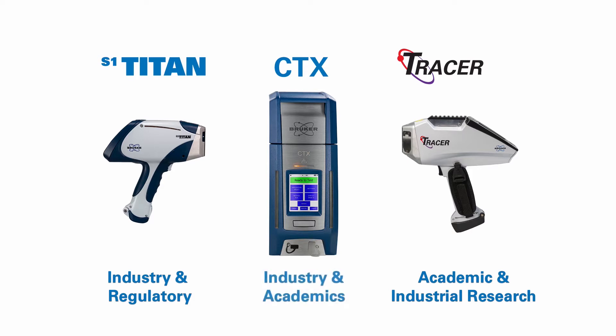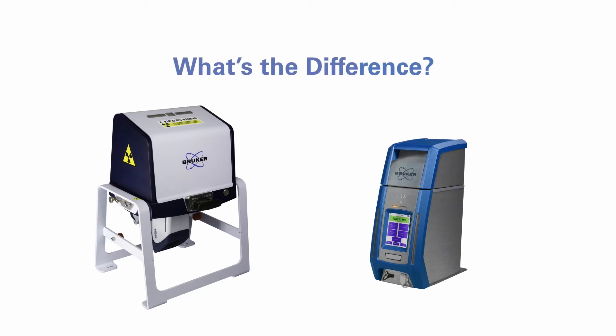The self-contained, safety-interlocked CTX is optimized for both industrial and academic analysis of small or prepared samples, as well as those presented in cups, bottles, and bags. An optional benchtop stand can be purchased with the S1 Titan, which makes the decision to purchase the CTX or the S1 Titan a tough one. Comparably priced, the CTX is self-contained with easy viewing of and access to the screen display, ports, and on/off switch.